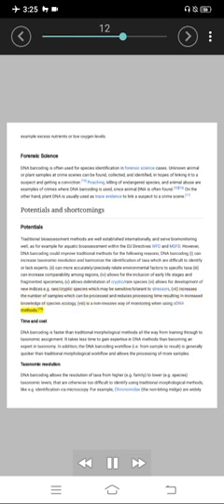Time and cost. DNA barcoding is faster than traditional morphological methods all the way from training through to taxonomic assignment. It takes less time to gain expertise in DNA methods than becoming an expert in taxonomy. In addition, the DNA barcoding workflow, i.e. from sample to result, is generally quicker than traditional morphological workflow and allows the processing of more samples.